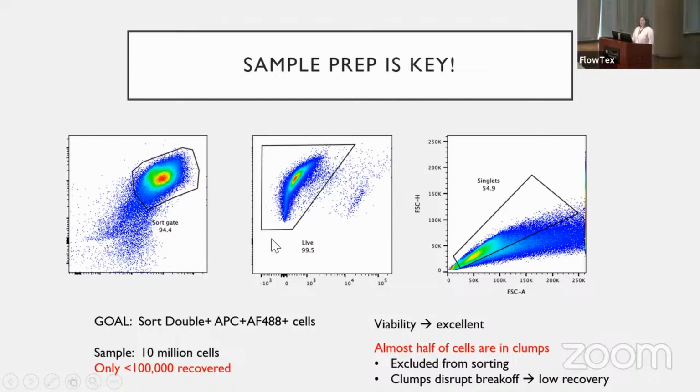So what happened to her cells? So we went back and just looked at her flow cytometry plots, and I was like, well, maybe they're all dead. They didn't make it through the dead gate, so we looked at the live dead stain, and they're actually quite viable. So these ones over here are the dead ones, and these are the live ones. If we look back one gate further, we see that in the singlet gate, she has a huge portion of these things that are over here, right? That they fall out of the singlet gate.